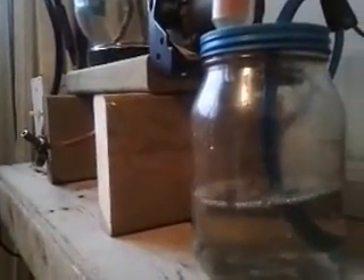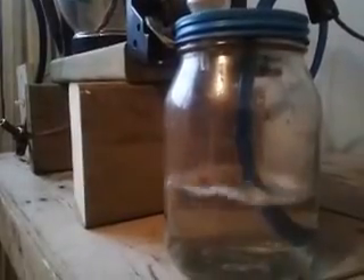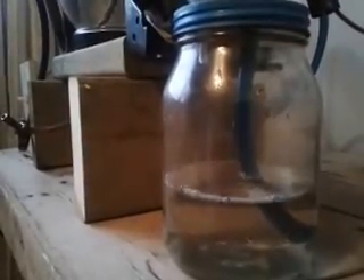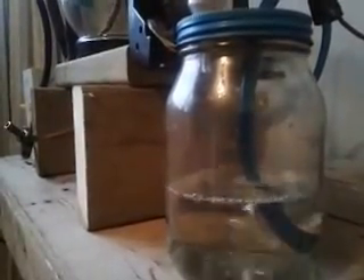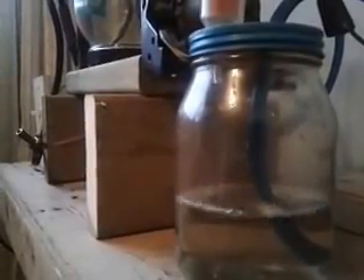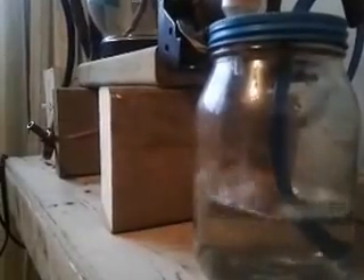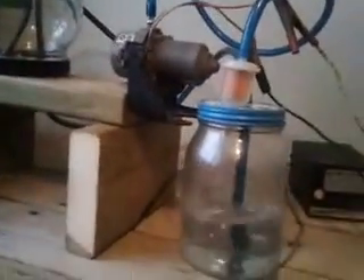I thought it might help the nitrogen dissolve into the water better if it's under lower pressure. Again, it's probably not much more efficient, but the truth is I didn't have a little air pump — I did have a vacuum pump, and I thought this would work pretty well.